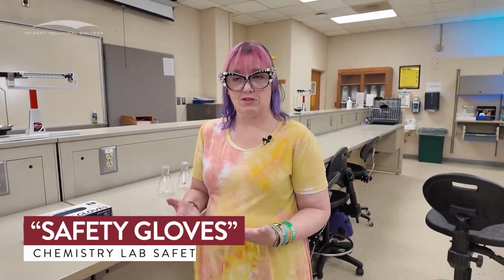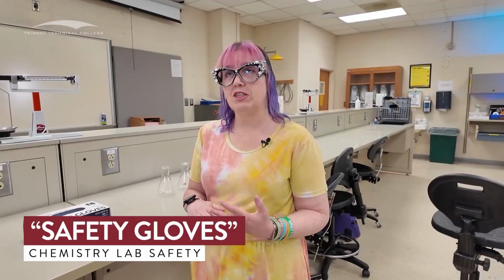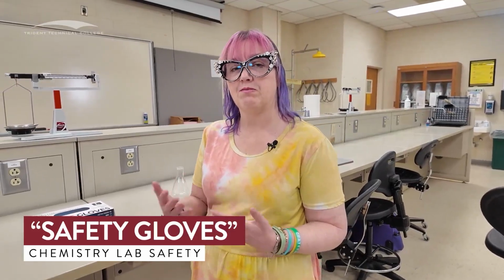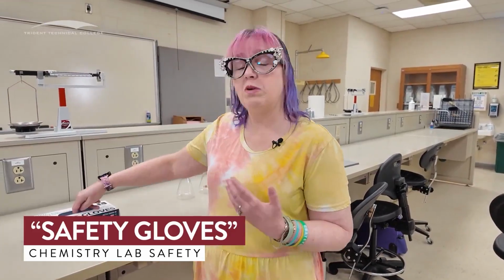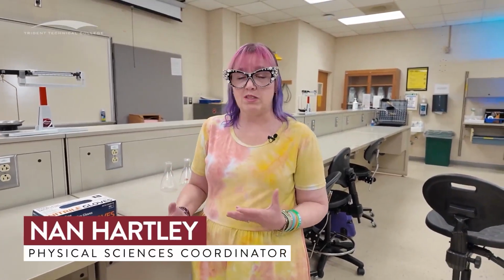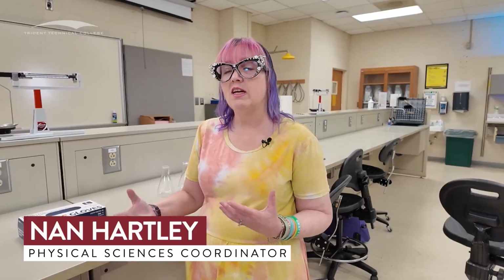Thanks, guys. So we've got a couple of experiments where we specifically need to be worried about our glove protocols. And those experiments are the solution concentration, the titration standardization, and the titration for the vinegar concentration. So when we talk about those experiments, it's absolutely necessary that we wear gloves for the entire experiments. For the other experiments, gloves are recommended. They're not necessarily necessary. It's never that we don't want you to wear them, but you don't have to wear them for the other experiments.